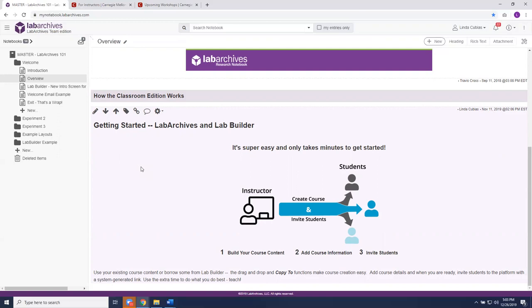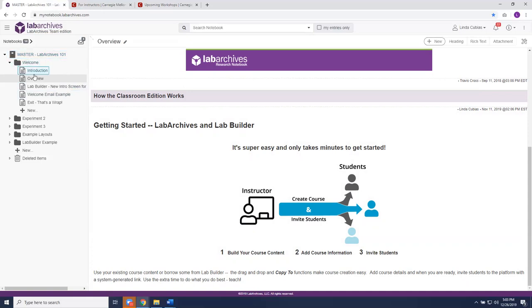Our next step is to walk you through the process of creating a new master course notebook that you can then use and invite students to. We'll start with a brief introduction of the structure of the master course notebook and take you through the notebook navigator and notebook manager tool. Looking at the left panel, this is the structure of our current notebook. We're using a notebook labeled 'Master Lab Archives 101.' Lab Archives is structured on a hierarchy: within the notebook, you create folders; within folders, you can have subfolders; within folders you find pages; and within each page, you find entries. We're going to spend some time building out the pages and using different entry types for adding data.